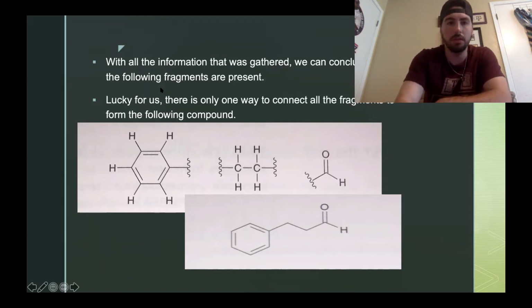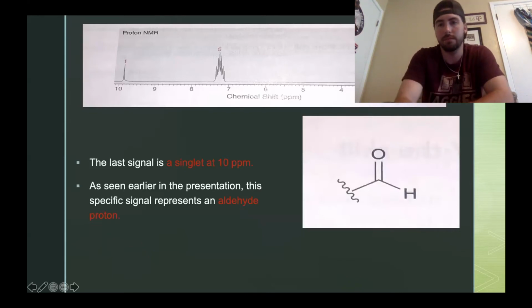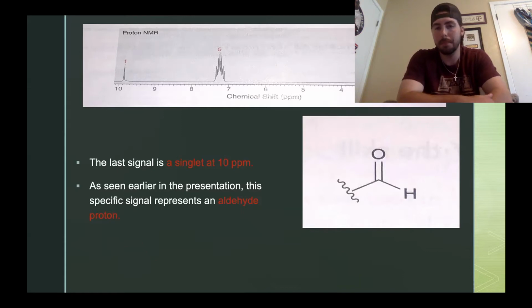Yes. Thank you. Right here? See that? So you see those two CH2s, and each has only a triplet. That's because they're isolated. Next to the CH2 on the right, you have the aldehyde, and next to the CH2 on the left, you have the benzene ring. So there are no neighbors coming in from both sides. So these are all clues, and the more problems you do, the more you will see these.